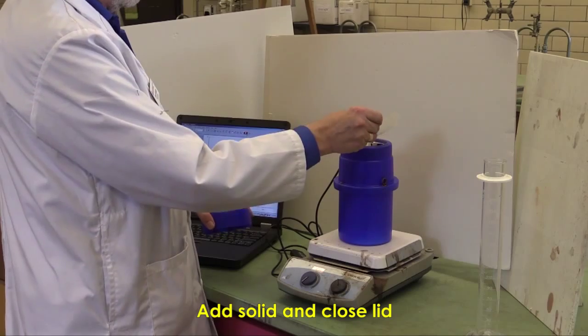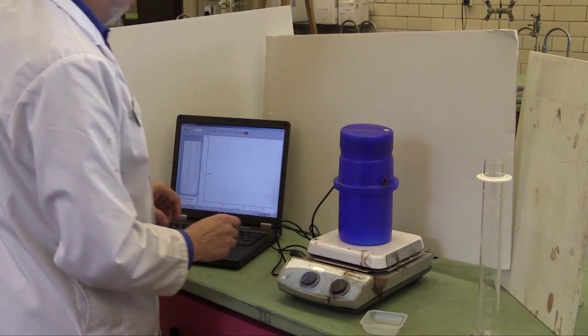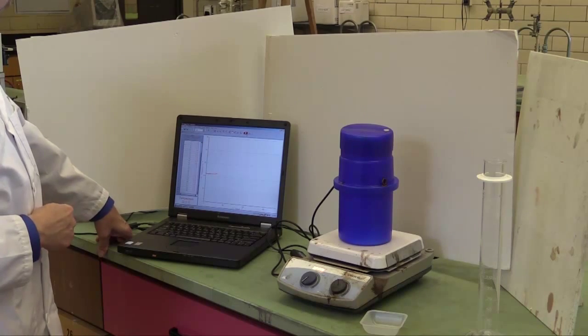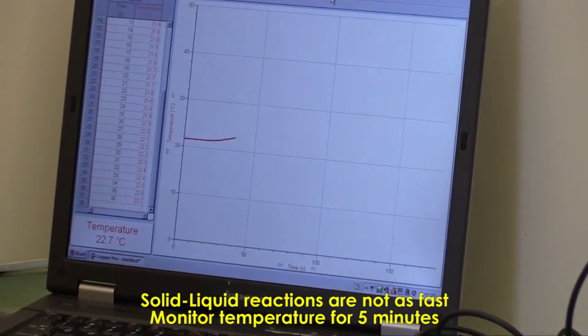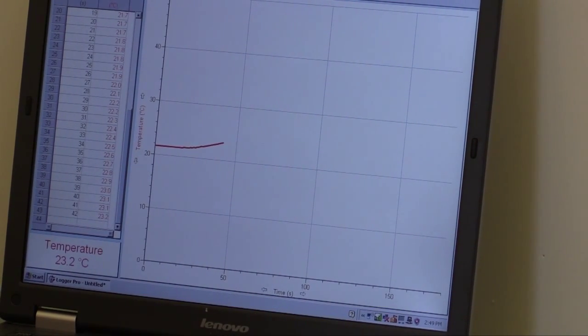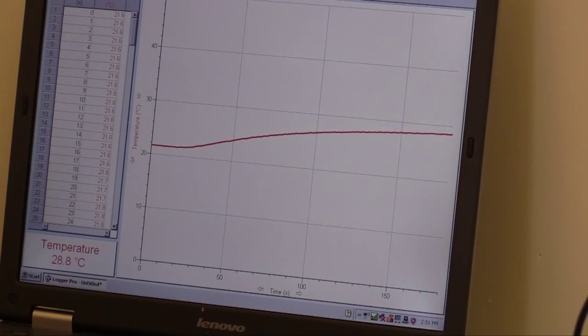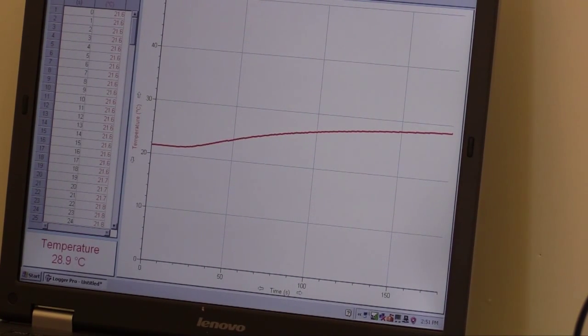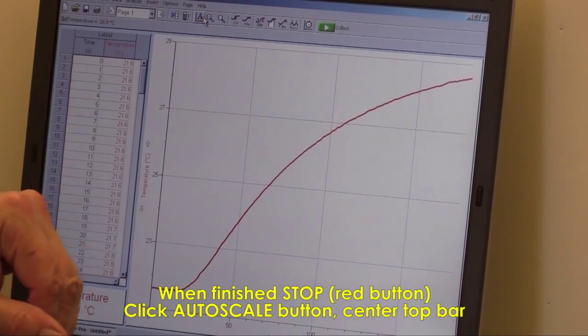And this is recording 21.6 degrees fairly consistently. I'm now ready to start the reaction. And to do that, I put all of the magnesium in. Tap to make sure it's all out. Put the lid on and watch the reaction. It's taking a while, but the temperature is going up slightly. This one is not as fast as just mixing acid and base or indeed hot and cold water. So we'll need to wait for this one until we reach a maximum temperature. All right. This has now come to a stable temperature. It's taken a few minutes to do that. So we stop it and then auto scale. You see it's a much, quite a long slope, but it does get up to a high temperature.